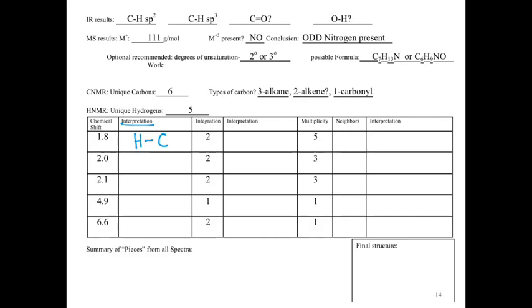Next part of this, we would move to the integration. And we'll now drop in our interpretation on the integration. The integration says there's 2 hydrogens. Remember, it is a ratio, so it could be 4 or higher, so we have to watch out for that. But we'll start simplest first. What's the easiest way to get 2 hydrogens identical to each other? Hopefully, come up with the idea that we attach them to a carbon. At this point you'll also notice that I'm going to start to add what I like to call hanging bonds. That means those bonds can't be hydrogen unless I've specified a hydrogen.